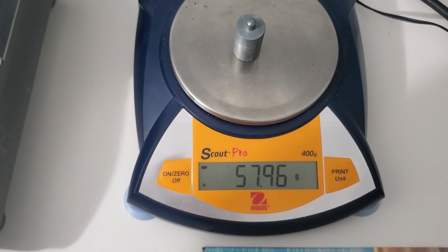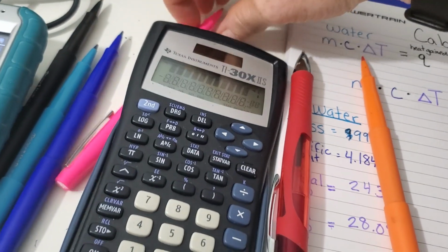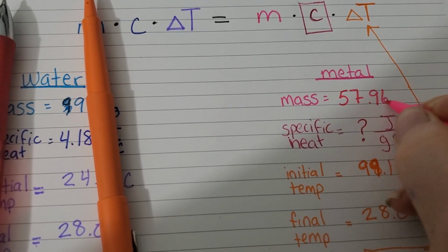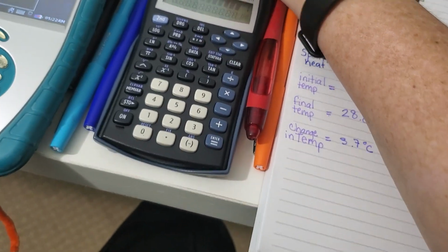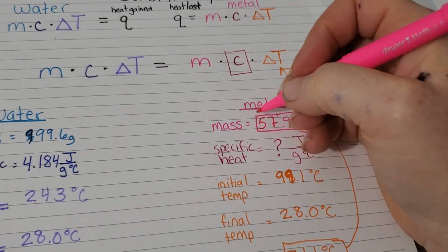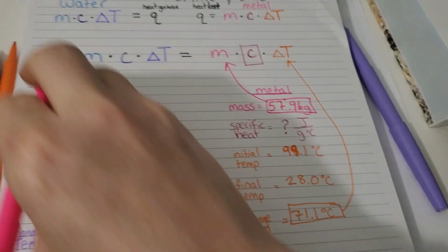And it has a mass of 57.96 grams. All right, and then this number goes in there.